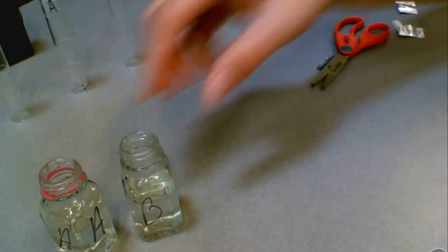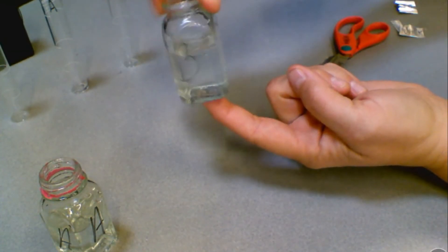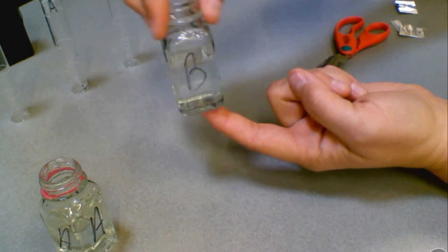Now go ahead and swirl each of your samples — watch carefully — and this will help ensure that the PhosVer-3 properly mixes.